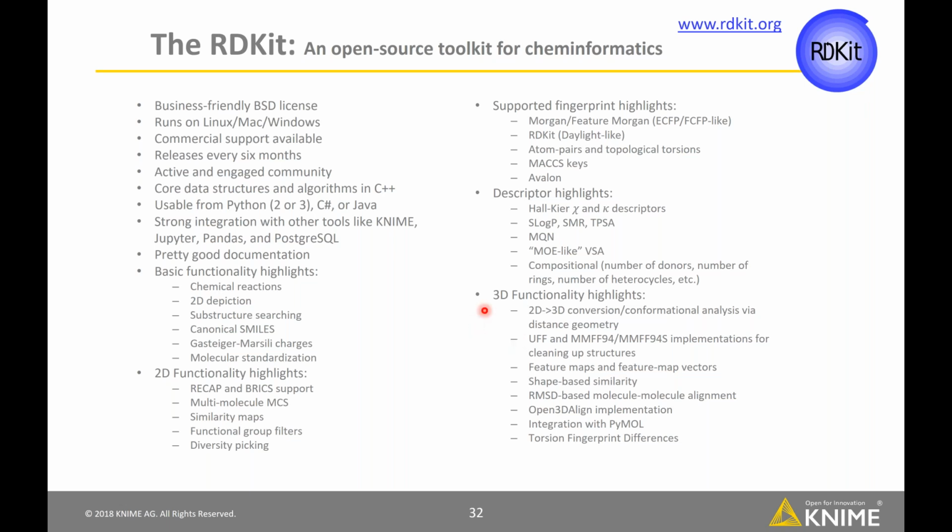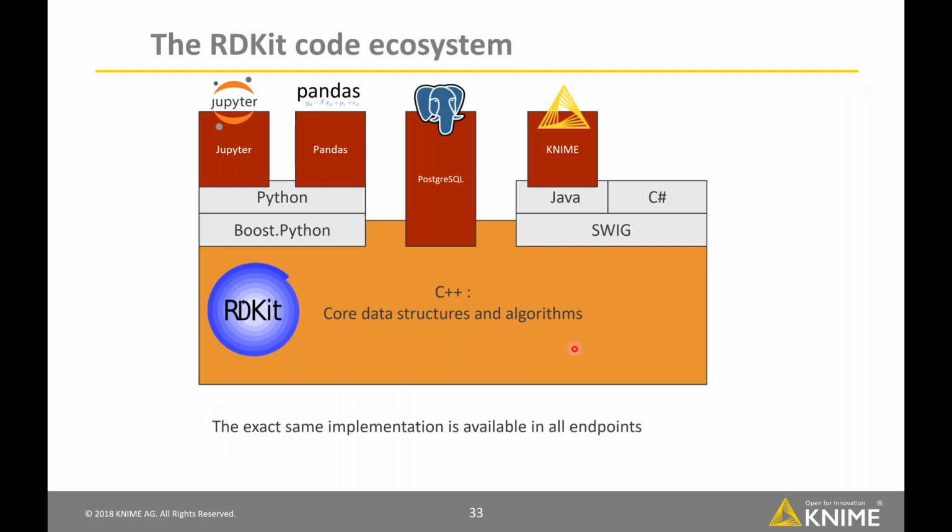We also have a very strong focus on integrating with other pieces of software. The core pieces of the RDKit are written in C++. The reason that's important is it allows us to use the same code from inside of Python. The notebook is what Sarina used to build the two original versions of the tutorial.